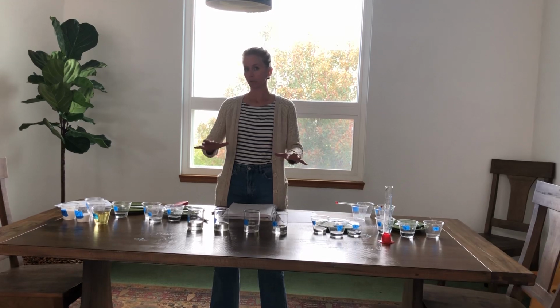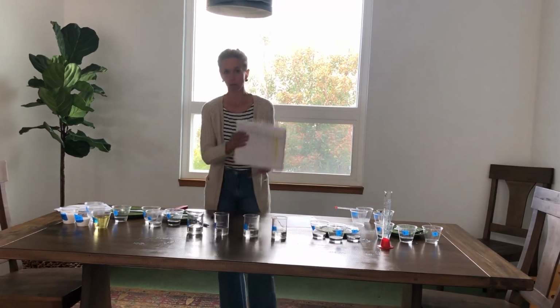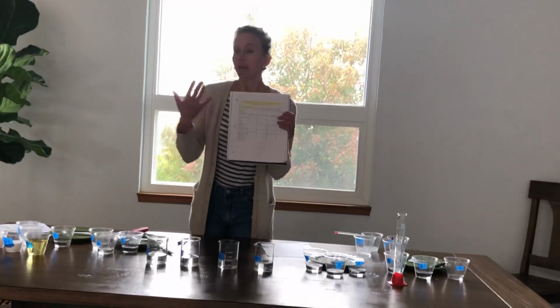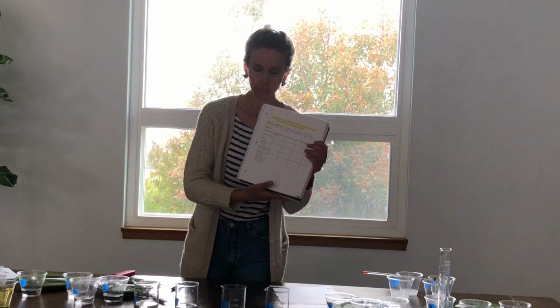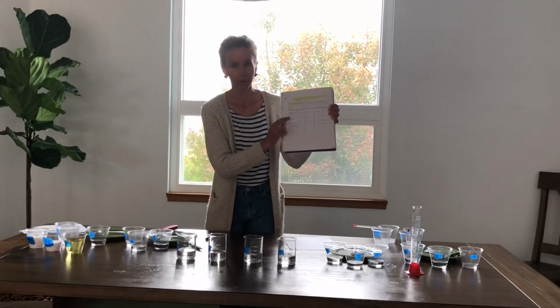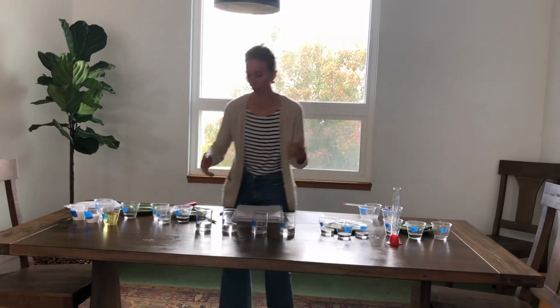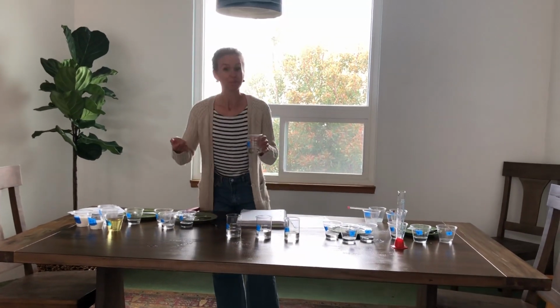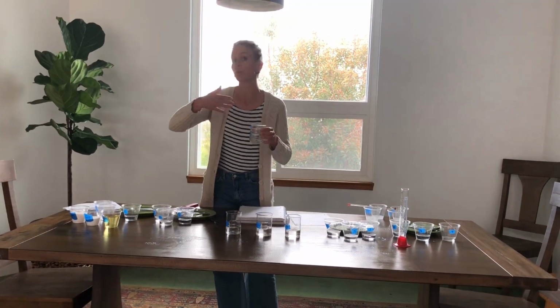Let's start simple. We'll start with odor. So you're in your table here on C10, and I'm going to have you fill in your table while I collect the data. So I'll tell you what to write down. So we'll actually jump down to that second row in odor. For liquid 1, it's going to be a yes or a no. In the chemistry lab, we don't just stick our nose in something and breathe in, we waft.